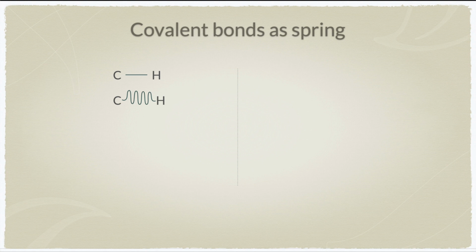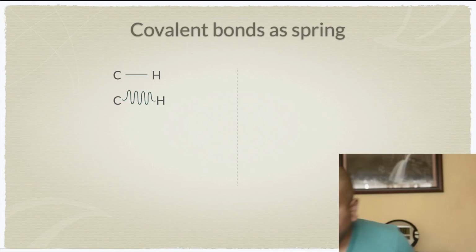I have something here, not exactly a spring, but if you look at this cord, okay, at equilibrium, suppose it's this much. Now you can stretch it further, or you can come back to that same location, or you can compress it more, but there will be a point where you cannot compress further. Okay. So, a covalent bond also behaves like a spring in this form. So, it can either be stretched, compressed, stretched, compressed, and there will be an equilibrium length or equilibrium point, which is known as the bond length. Okay. So, let us try to understand this better, how it interacts with IR.